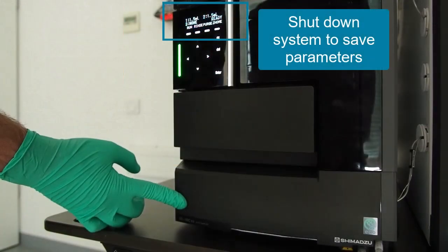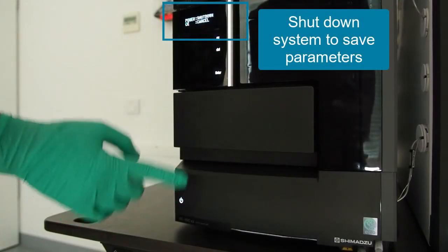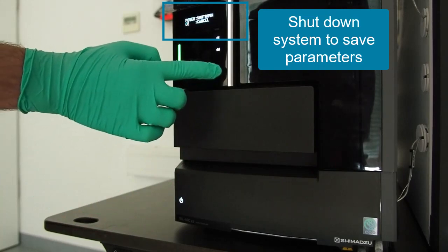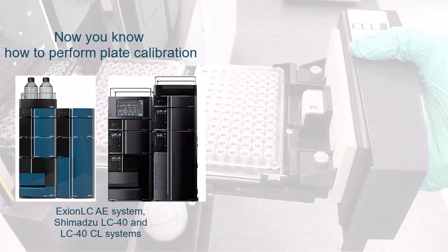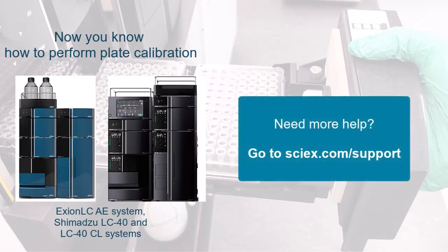Finally, shut down the system to save the parameters, so you do not need to repeat the procedure in case of mainboard issues. Now you know how to do a plate calibration for your auto-sampler. Go to sciex.com/support for further help on other topics.